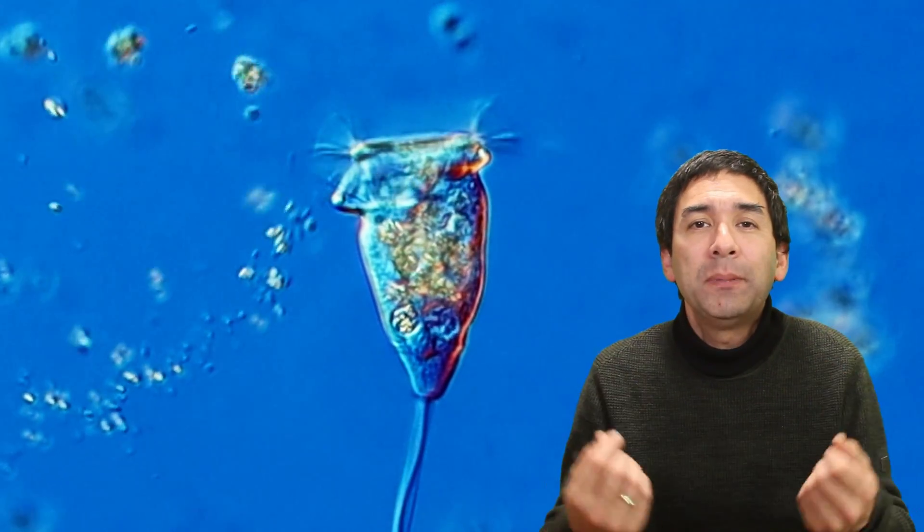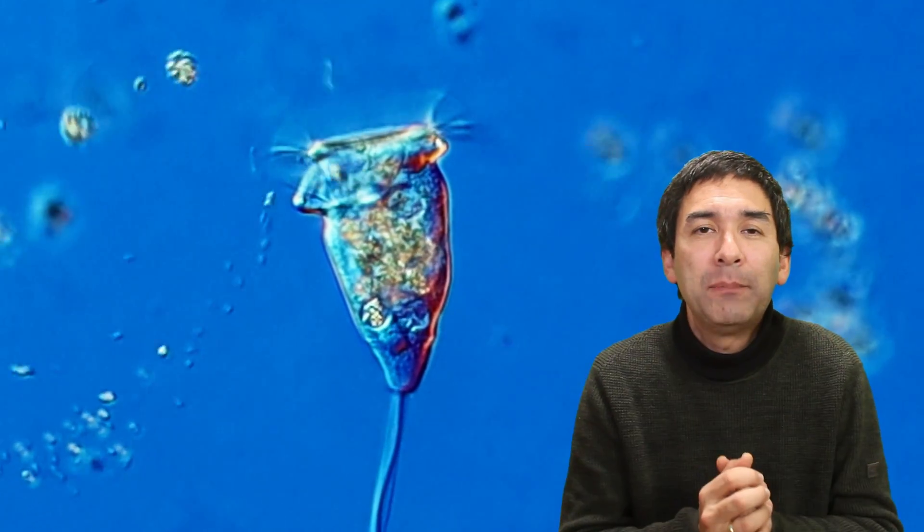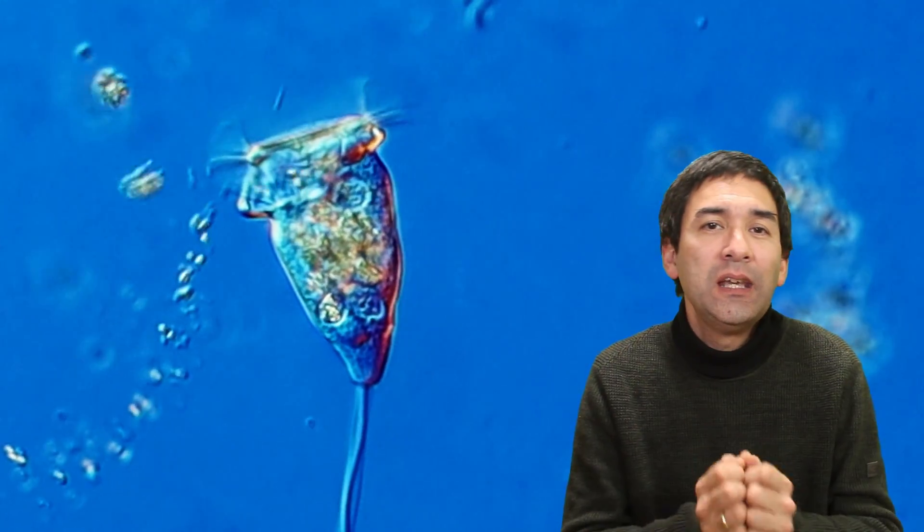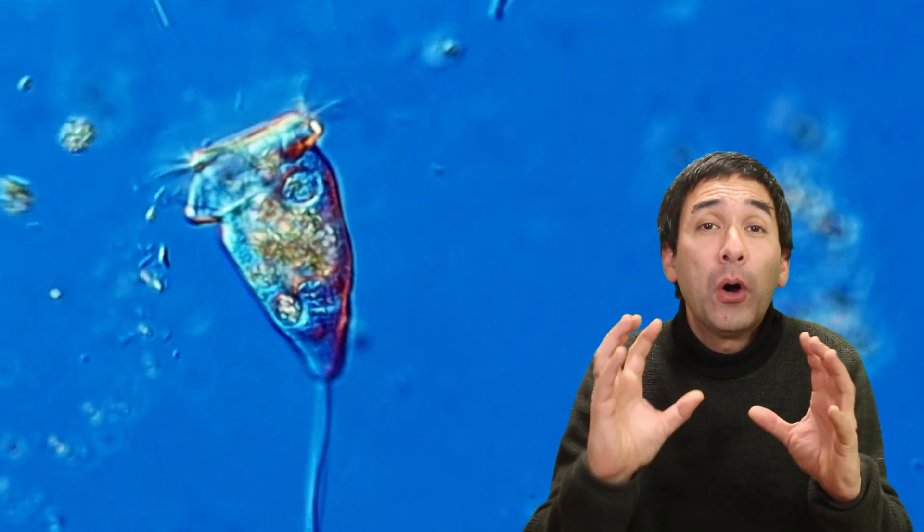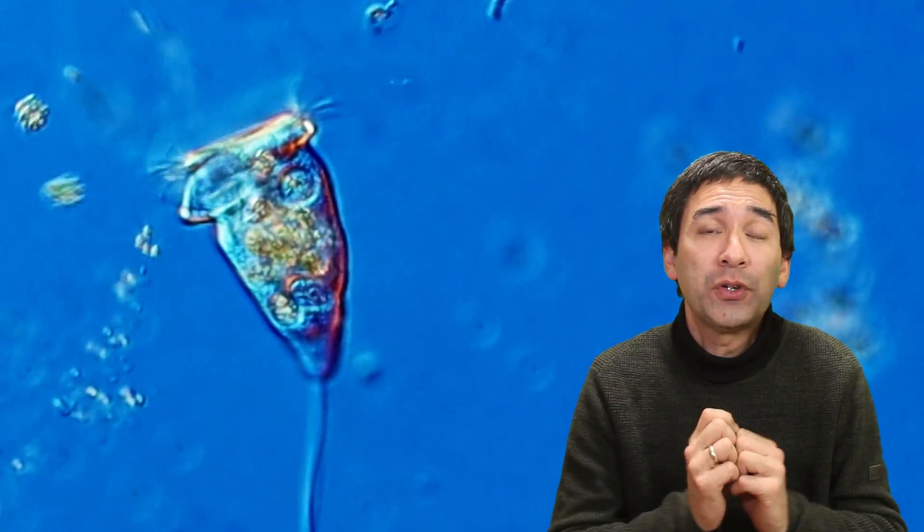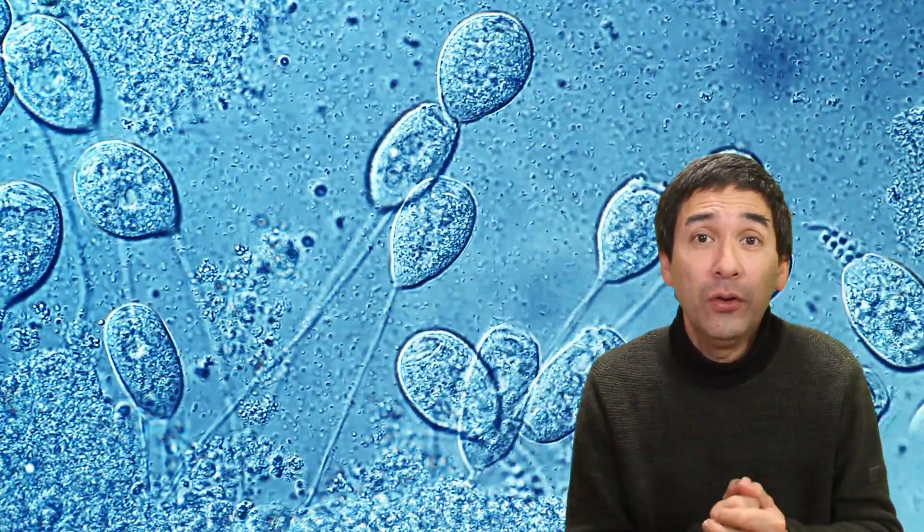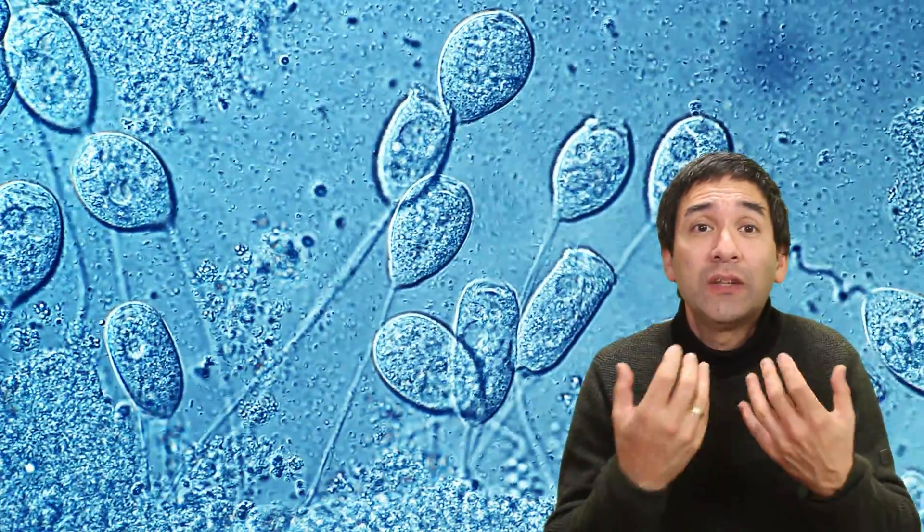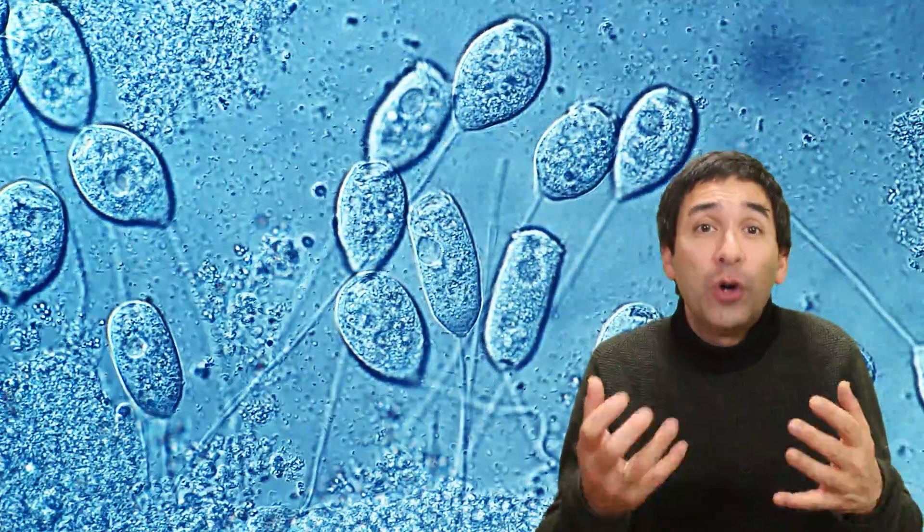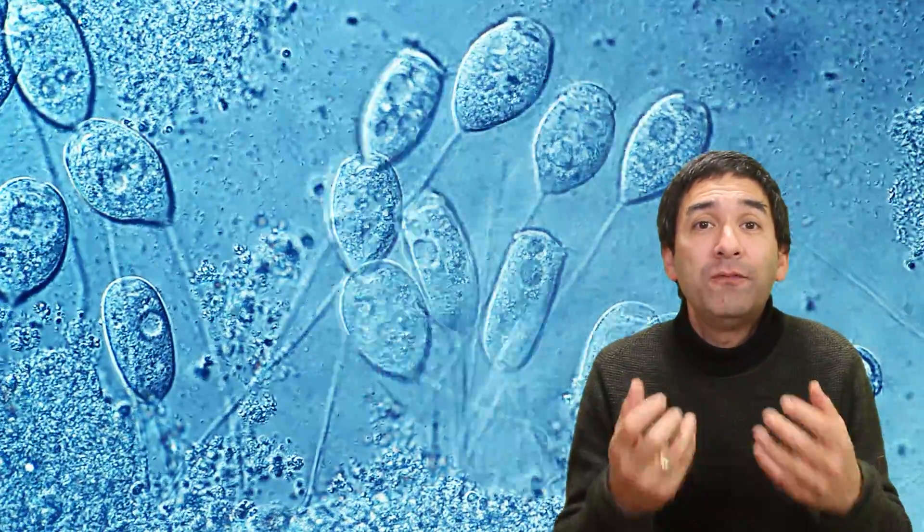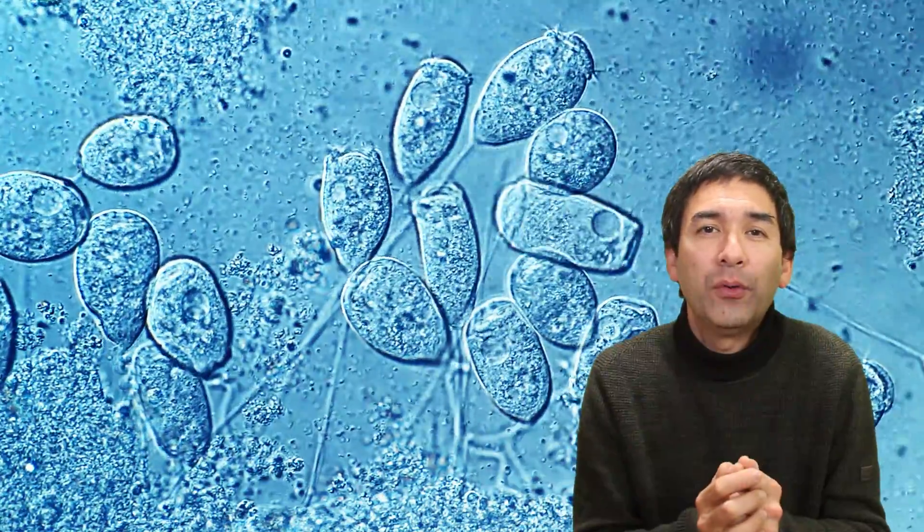And the cilia move quite rapidly and they are therefore a little bit difficult to see because of the rapid movement. But what you are able to see is the movement of the water or at least the particles suspended in the water that are moved around by the cilia. Vorticella is a heterotroph. This means that it relies on other sources for energy and nutrients. It does not do photosynthesis, but it feeds using its cilia and sweeps in food particles to its mouth.